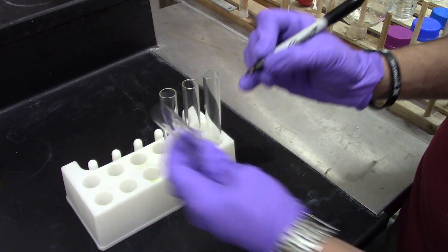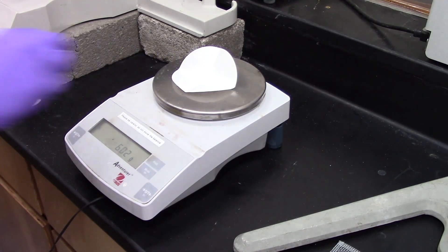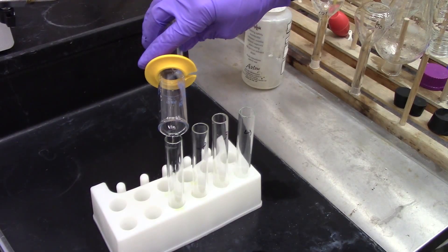The first step is to number four test tubes and place them in a rack. Weigh potassium nitrate and water into the four tubes as indicated in this table.